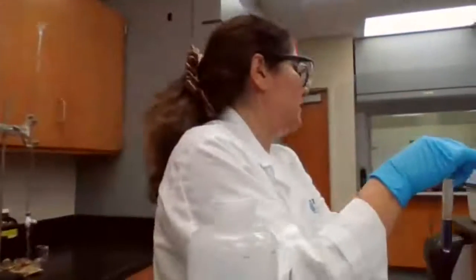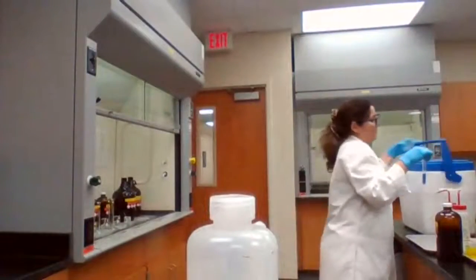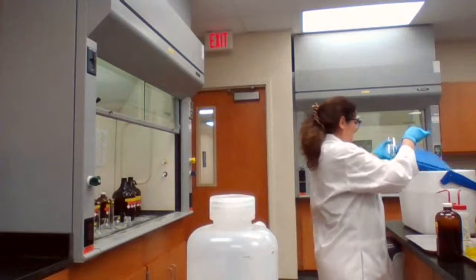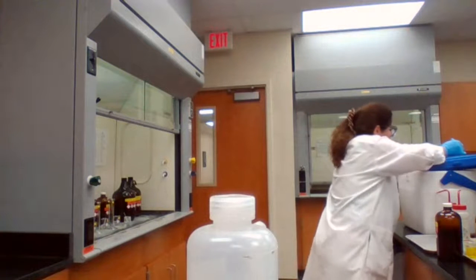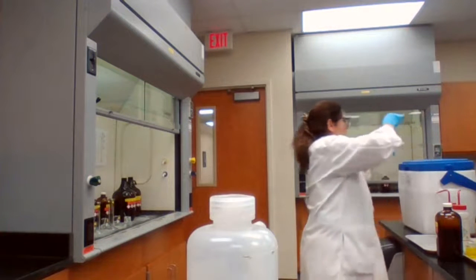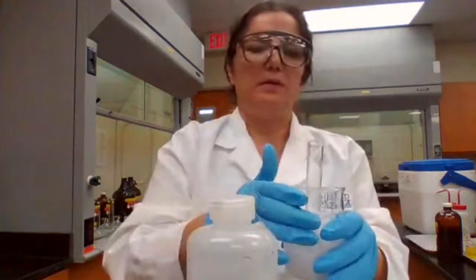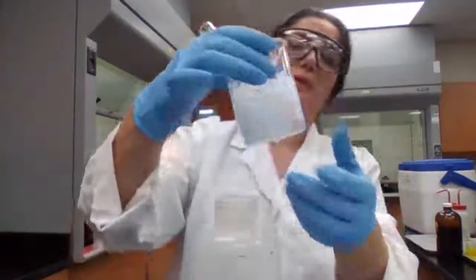Now, let's put it in the ice bath to see what happens if you place it in ice. Made the ice water bath here.